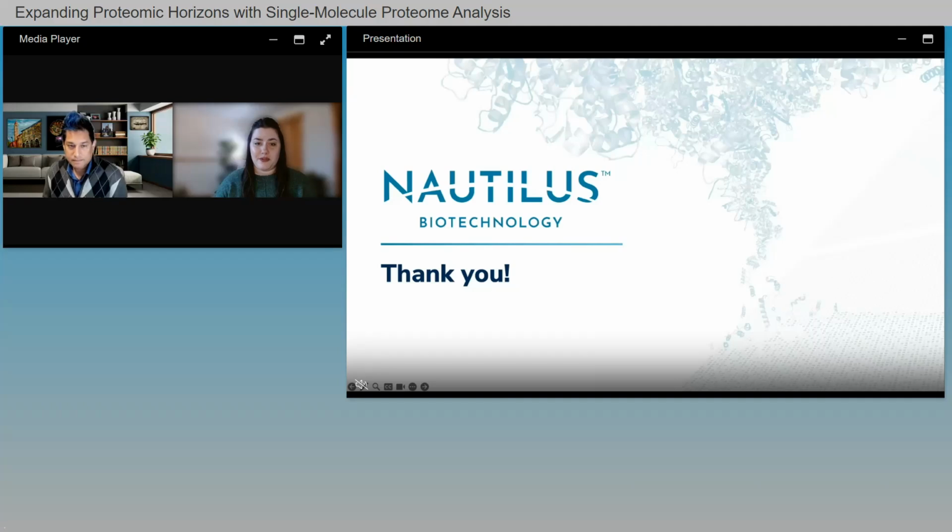Excellent, thank you. All right, our next question asks, are we able to detect all amino acids using the probes? Thanks so much for the question.